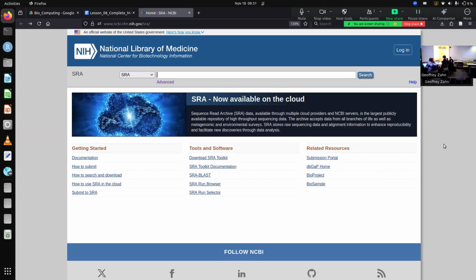Essentially what I am looking for is the pipeline we've been working on to assemble, annotate, and count all these reads. We've done it for one sample, but it's been done in for loops, so we can easily extend it by just adding accessions to that file of accessions and rerunning it. So great, we could go ahead and do 10 samples. That way we can actually start comparing some of the output.